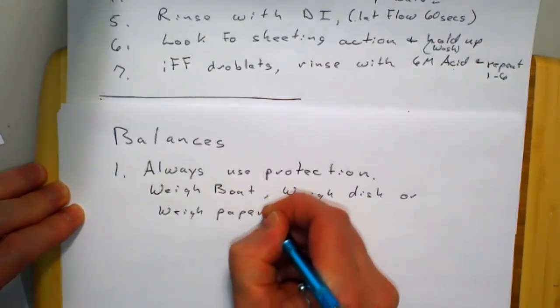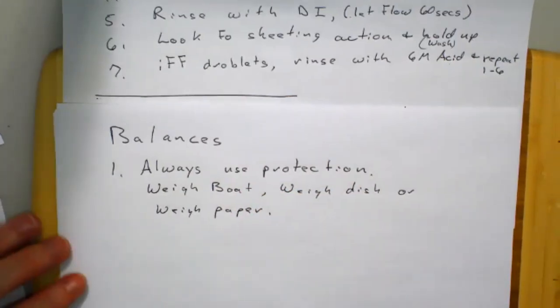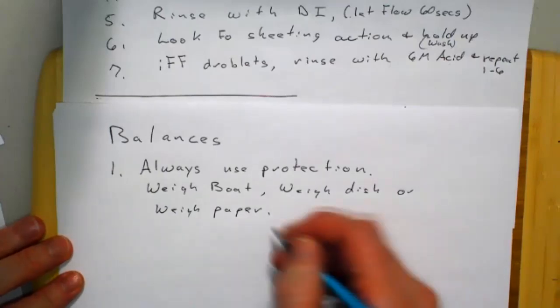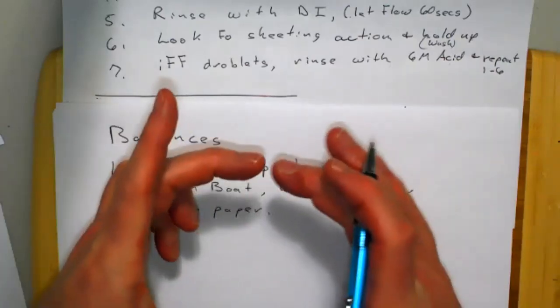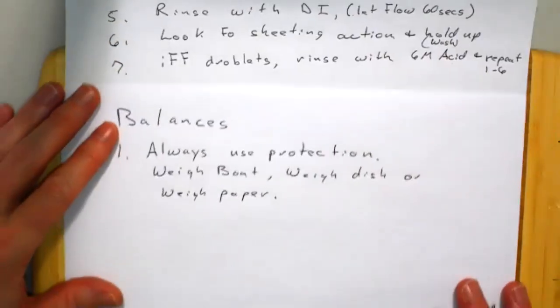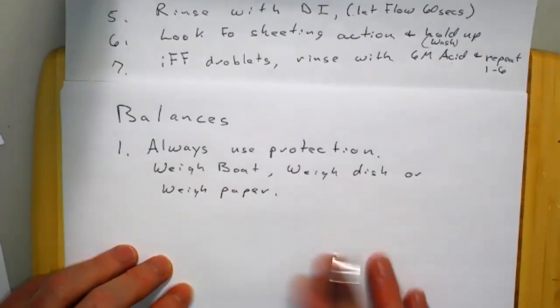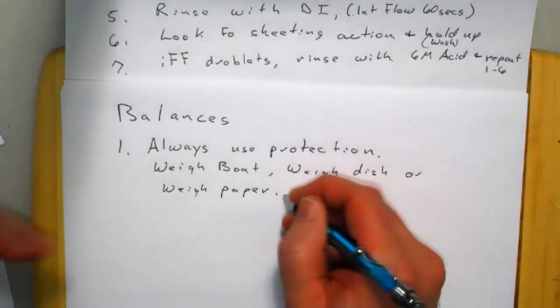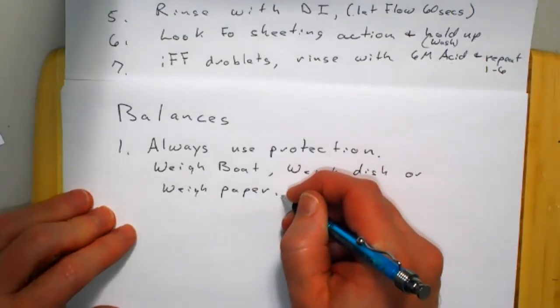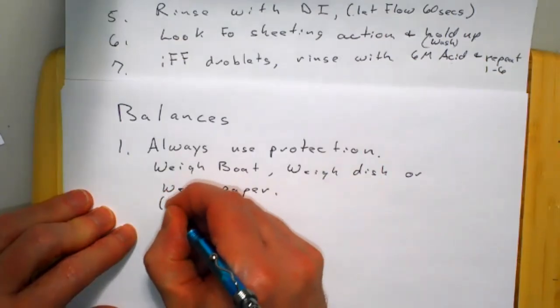There's more than one lab that uses the classroom we'll have lab in. So there's 2 types of weigh paper. This is the real weigh paper, and then there's going to be little scraps of white paper. Don't ever use those because they're too fuzzy on both sides. So weigh paper is usually your best because it's a low weight material, and it's like a car, shiny side up.